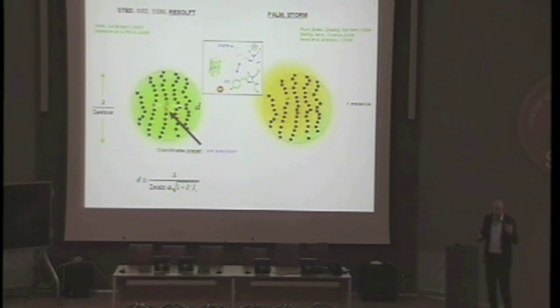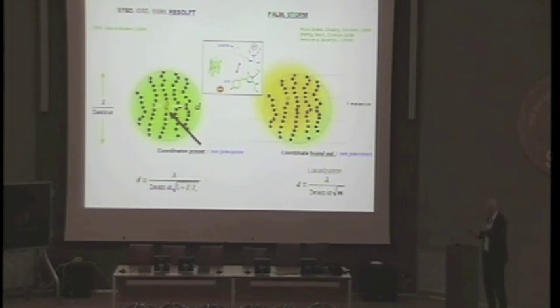So what you have to do is find out where it is located. Now you can do that under one condition, this is the restriction here of course, that this molecule is capable of emitting many photons in a row, in a bunch. Because then, of course, you can find out where it's located just by making the centroid of this, say, pattern of diffraction that is produced on a camera. So what you do, you take a camera as a reference coordinate, image it on the camera, calculate the centroid, then you know where the molecule went to the on state, register that point, and turn it off.